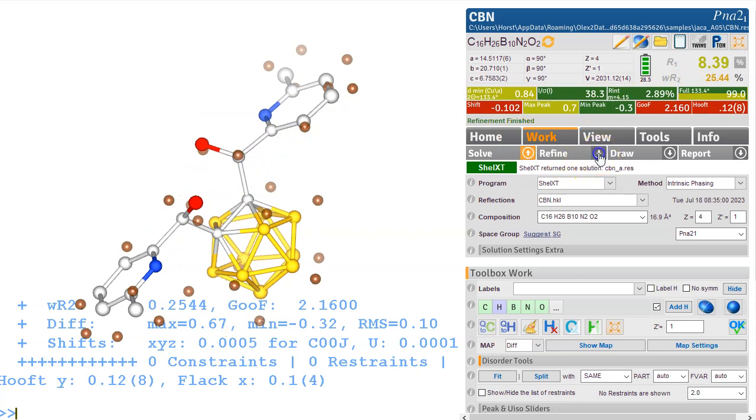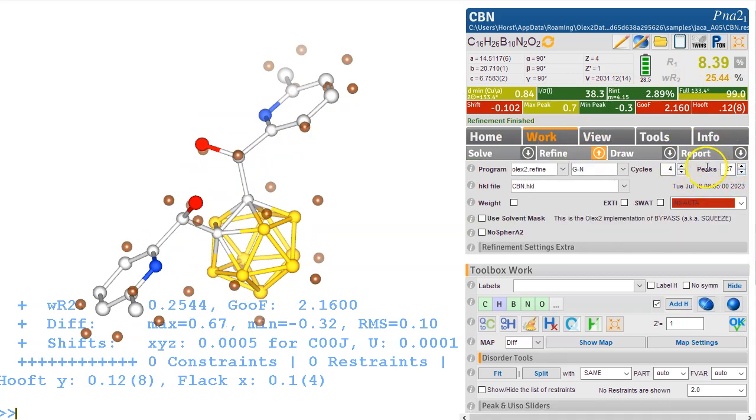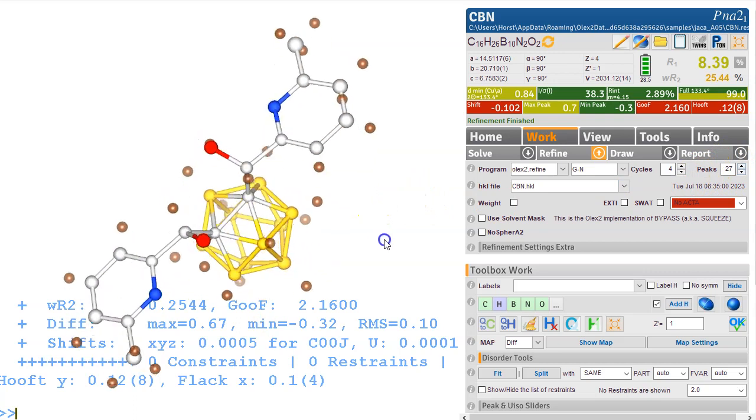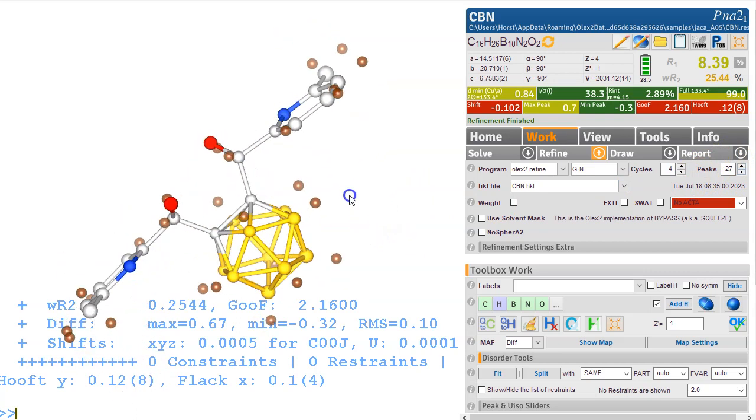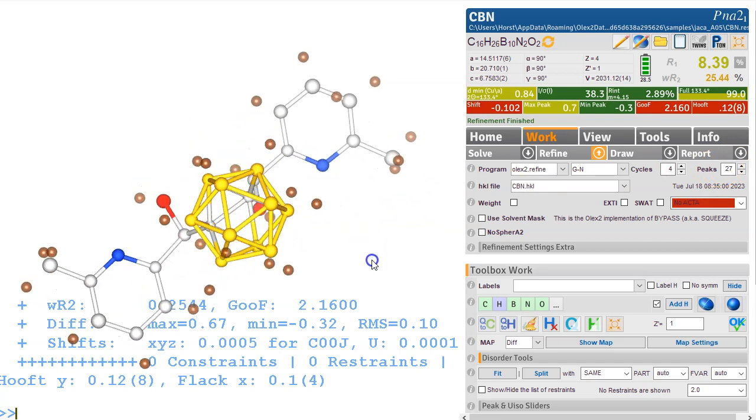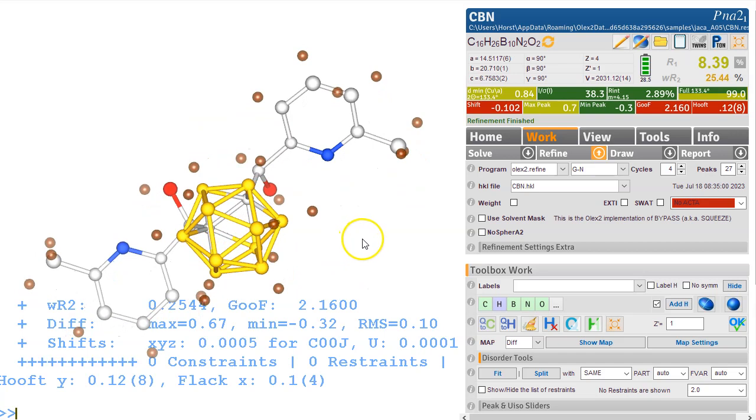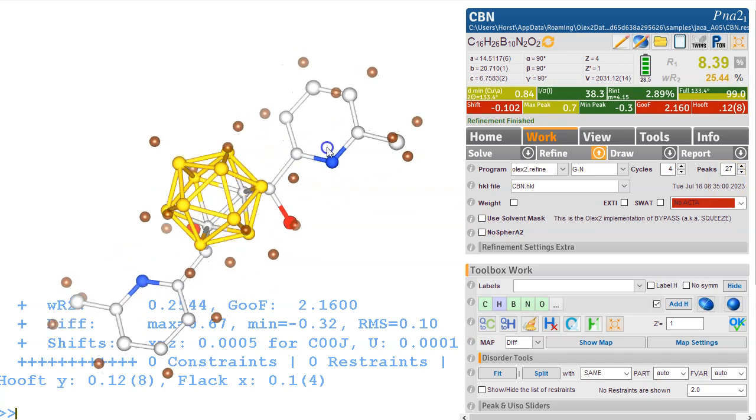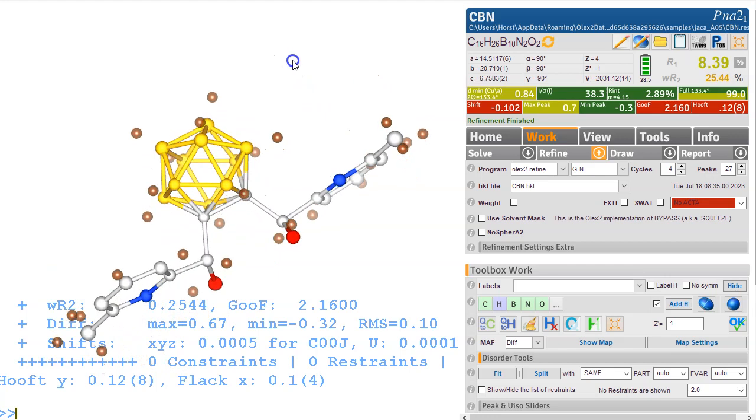Olex2, by the way, is set to show the number of peaks that it expects. So Olex2 looks at the structure and thinks, how many hydrogen atoms are required? And this is roughly, it's a good guess, but it's a guess. So it seems to think that 27 hydrogen atoms are required. And this is what's showing. So the peaks that are showing here correspond to the number of hydrogen atoms. If you change that number here and put another number of peaks, then Olex2 will just show that number of peaks. So this is a bit of automation that is quite useful, I think, because you can see what's happening.